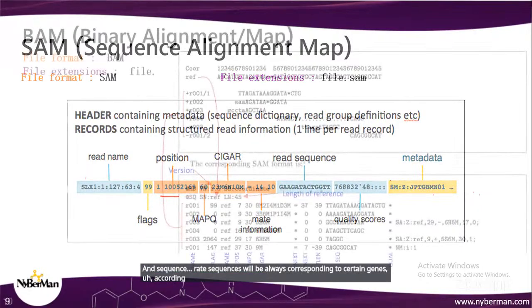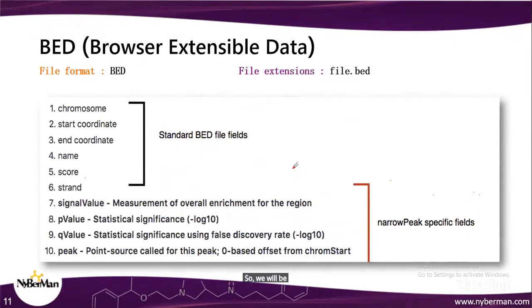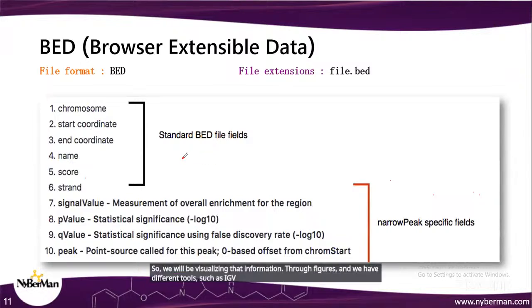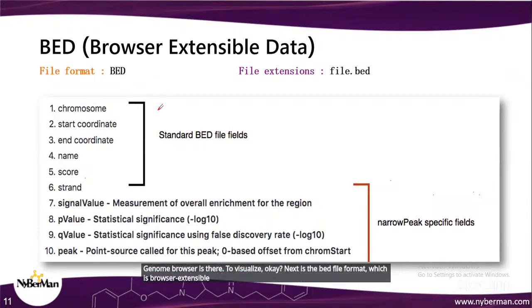According to their positions. Okay. So we will be visualizing that information through figures, and we have different tools such as IGV and other tools. Genome browser is there to visualize. Okay. Next is the bed file format, which is browser extensible data file format.